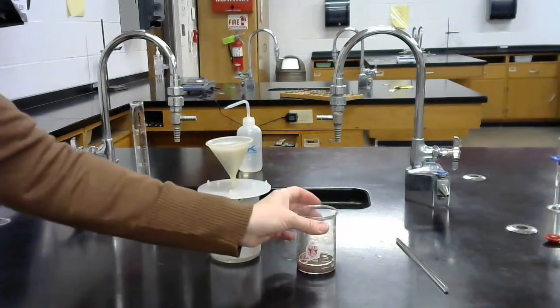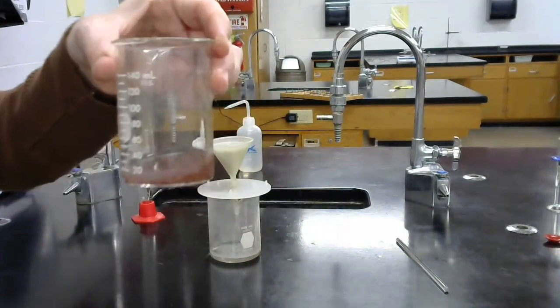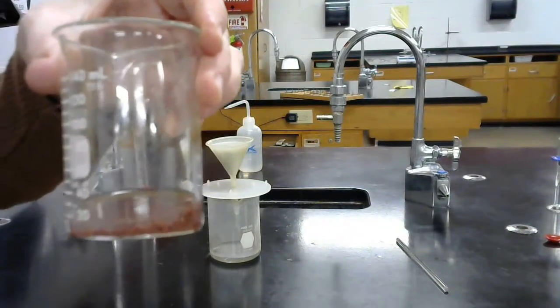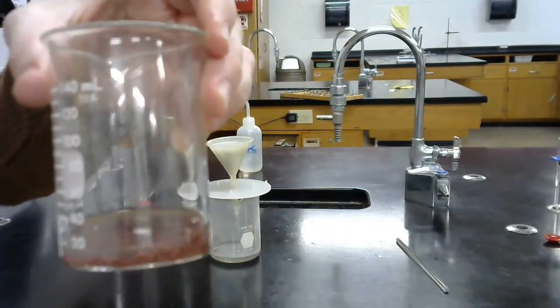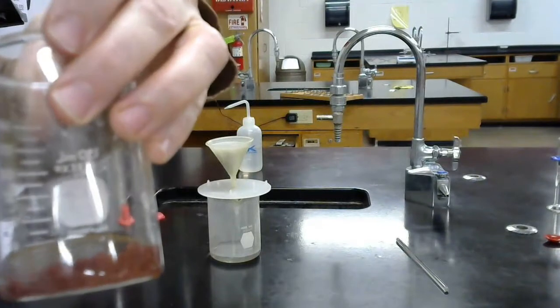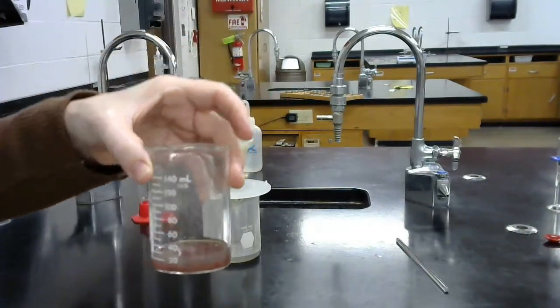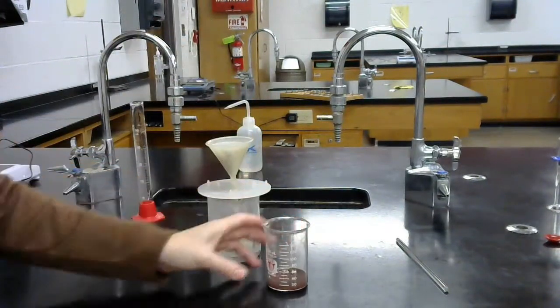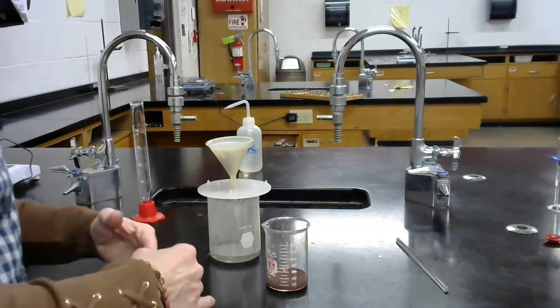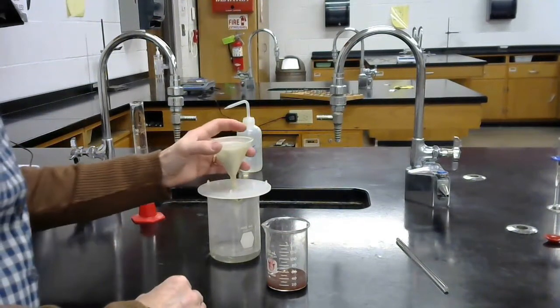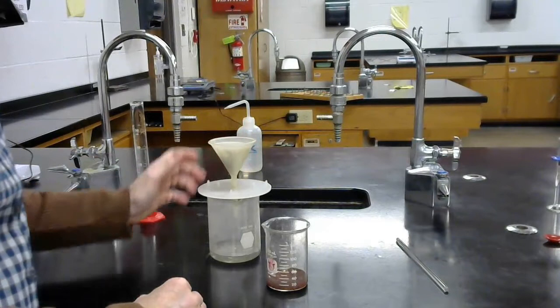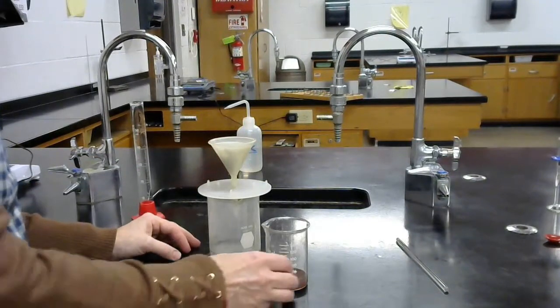And you can see in the beaker, there's my precipitate. So there's the precipitate that we're going to collect. So we'll collect that on the filter paper. Put the filter paper in the oven to dry it out so that there is no water in there, because we're not including water in the reaction.